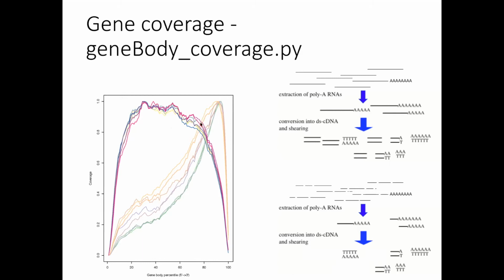Because in this sample, even if you have a super long transcript, the representation of it is only going to be a short one. Whereas if you have like this, the super long transcript is going to have multiple fragments. Whereas in the degraded, it's only going to have a few. So then when you're doing differential expression, that is going to be a problem for the analysis.